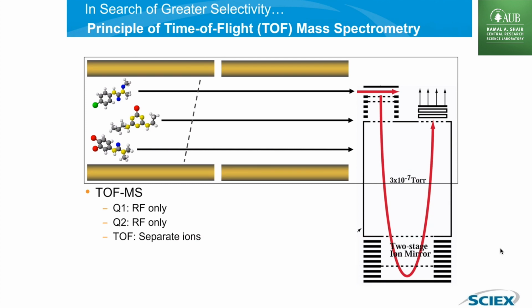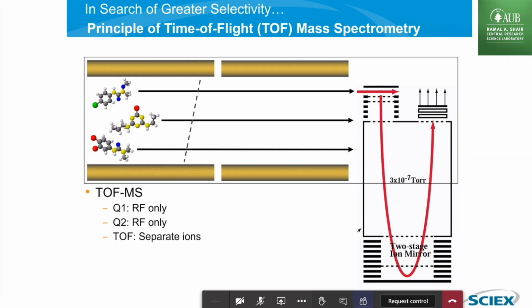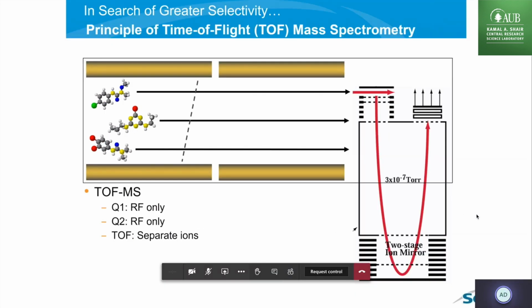Chromatogram is the collection of the mass spectra over time. So you can start to see here we have 3 dimensions of the data, right? We have the dimension of time. Time is ongoing. And for those of you who already worked with LC, you know that the time is mostly governed by the LC, right? You have your runtime. Okay, your experiment lasts 15 minutes.